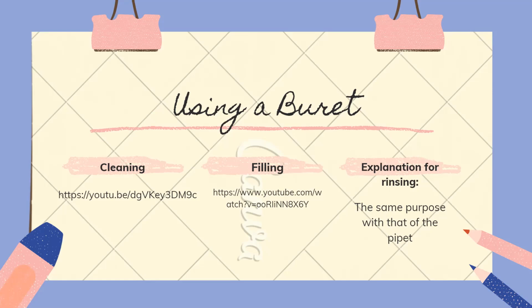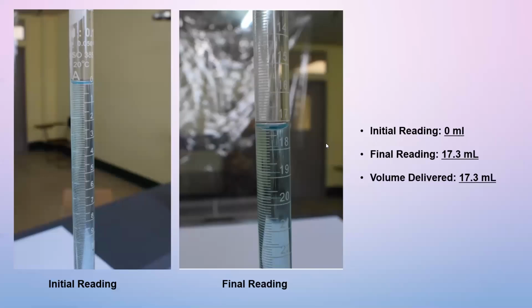So you have to rinse your burette with the solution that you're going to measure and deliver so that ma-acclimatize siya and ma-ensure na the same ang concentration sa ato ang solution all throughout. Dili makadagdag ang water sa sulod sa iyahang concentration.